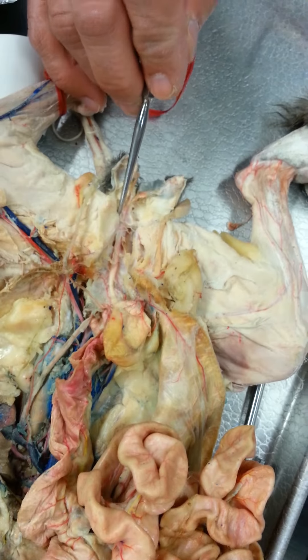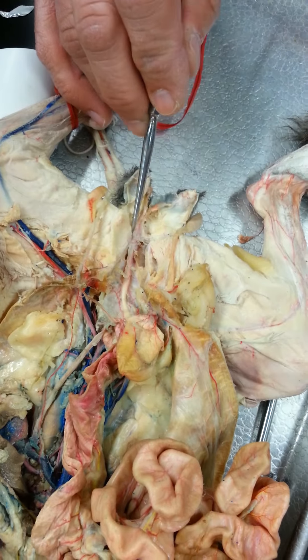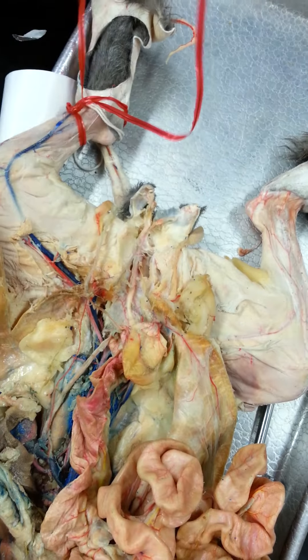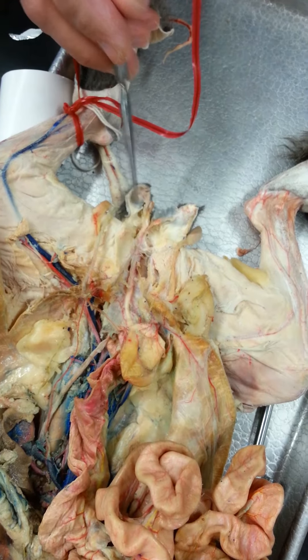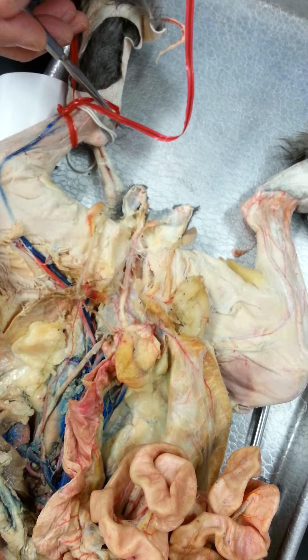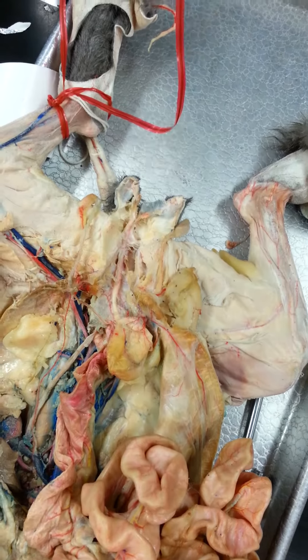And you can actually see the cura of the penis, and the bulb. So you can actually see this stuff — it's a pretty good dissection where it shows, because a lot of times it gets disrupted. And this would be your scrotum right here.